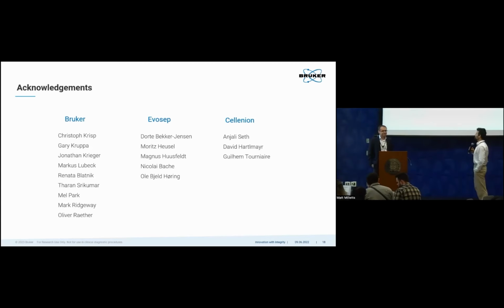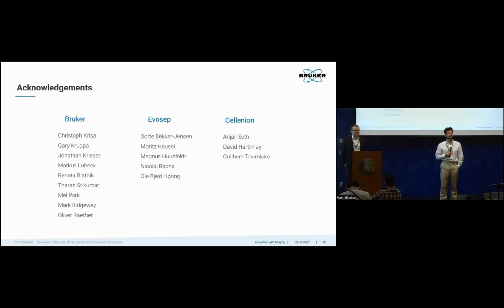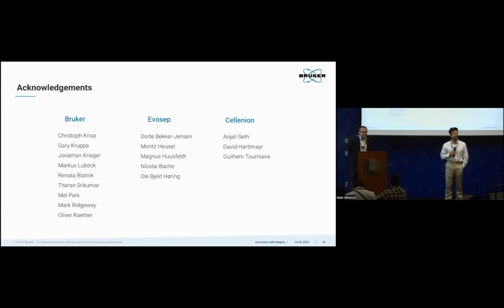Thank you very much, Matt. Are there questions for Matt? I'm going to start with one while you're thinking of a question. How much benefit do you think there will be for proteomics by further increasing the resolution of TIMS, maybe going to 1,000 slices? And how feasible is that?